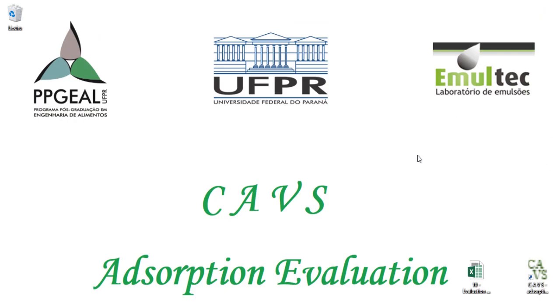The steps in the adsorption and desorption kinetics modules are similar to those presented in this video.